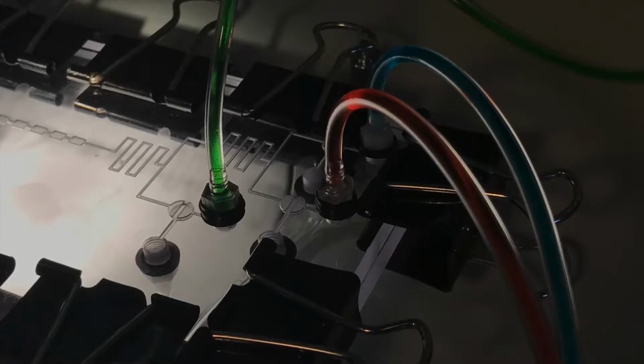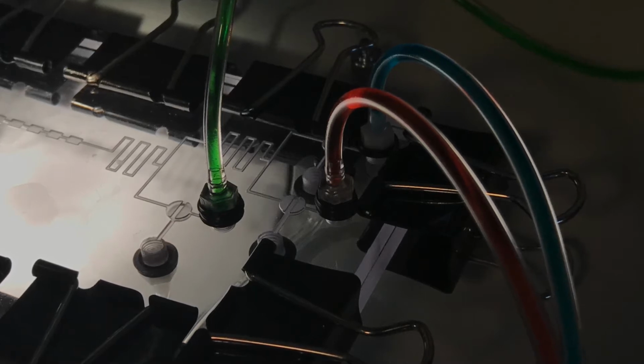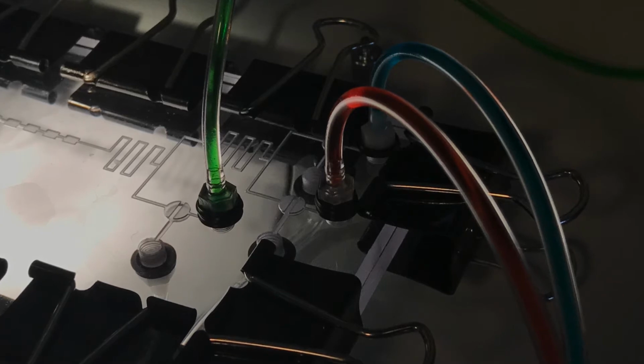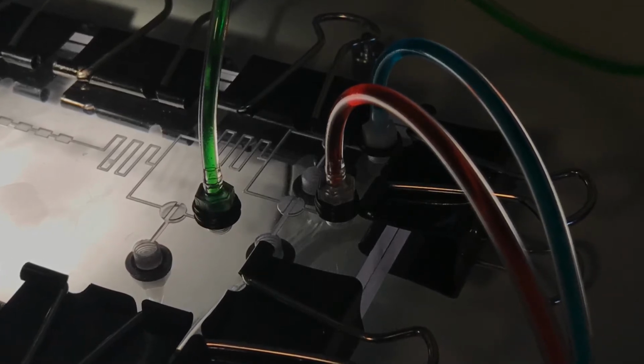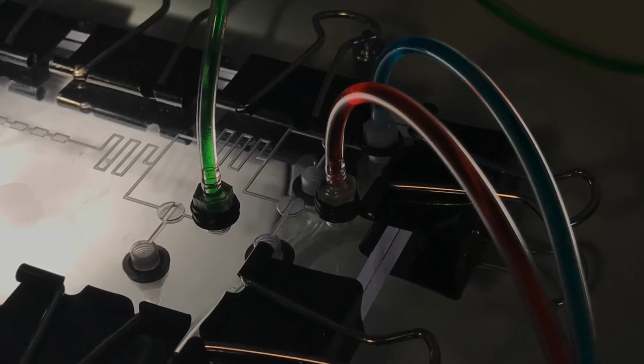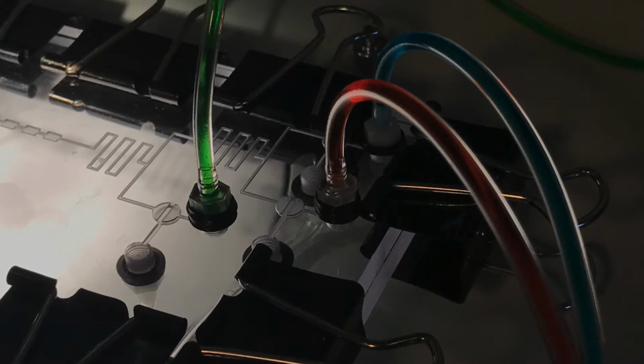With a microfluidic device now milled and successfully tested, or at least fluid functional with components derived for cell observation that could be further refined later, we now move on to the next portion of our project. Our design was intended to be somewhat flexible in that it could be used with different protocols, such as ones that involve different mixtures but still had a need for observation.